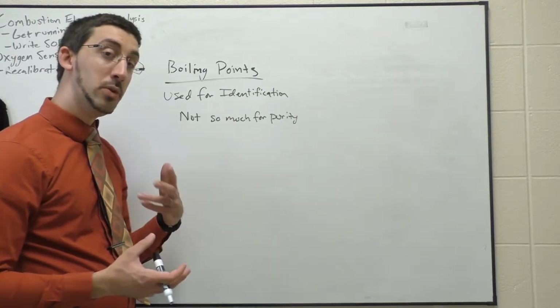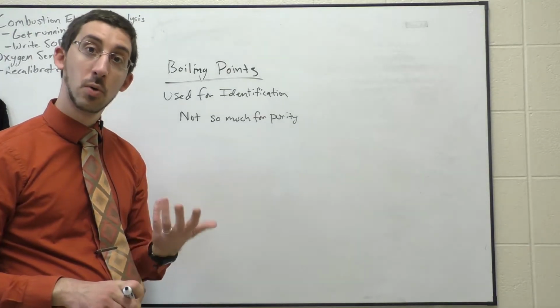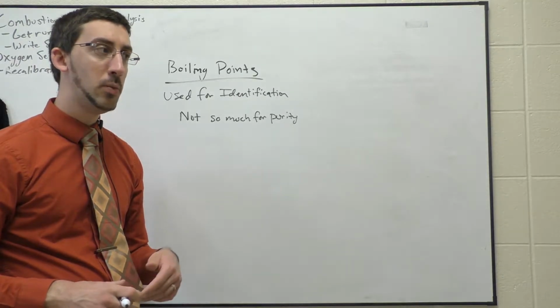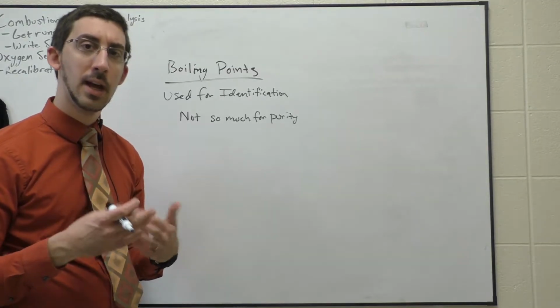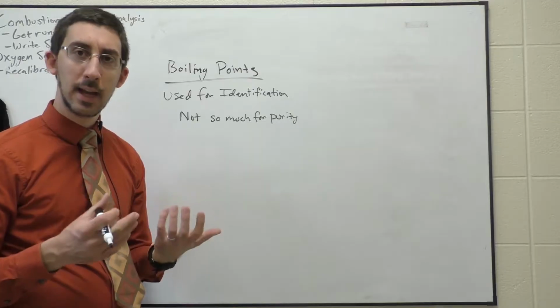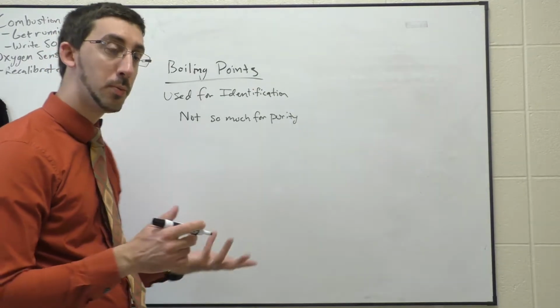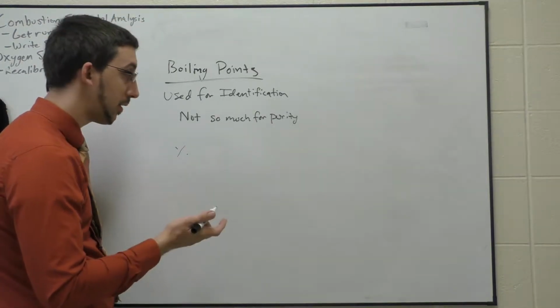Now, what we'll do in this experiment is we will measure the boiling point for a known compound, isopropanol. And whenever we do this, we want to measure the boiling point multiple times and then average those measurements and calculate a percent error relative to a known literature value. So percent error I can calculate in the following way after I've averaged my values.